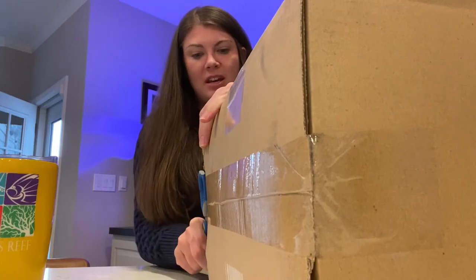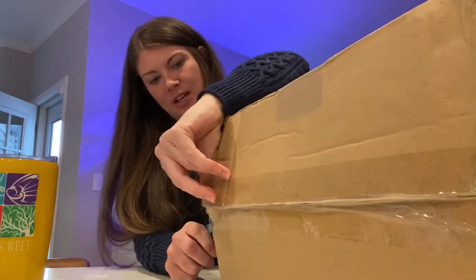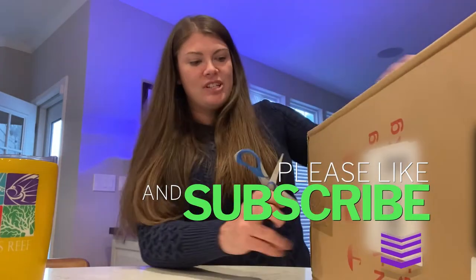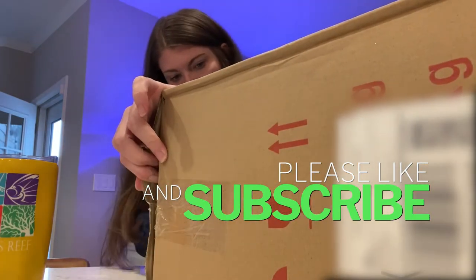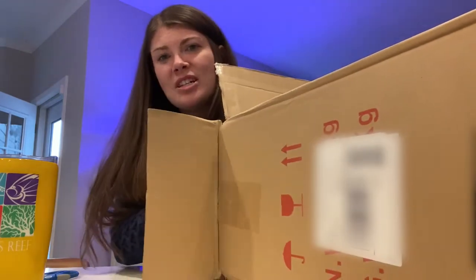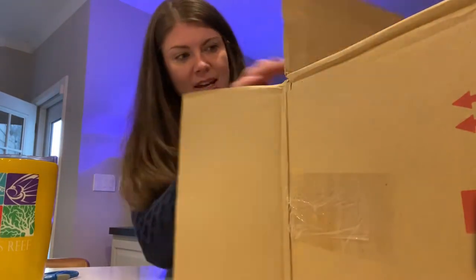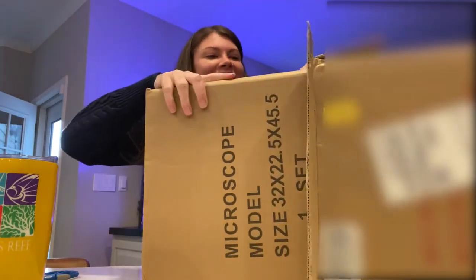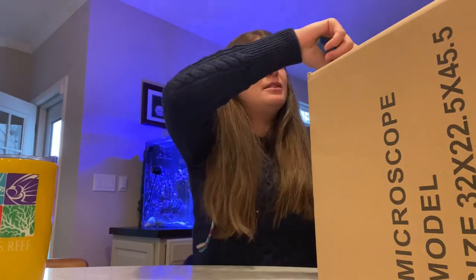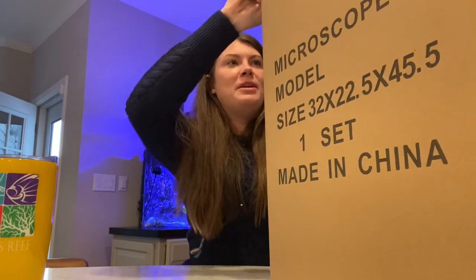I got a really nice microscope that I'm going to use to look at stuff in my tank. So hopefully it'll allow me to kind of start to identify some cyano, dinos, and different algaes, and if the fish are looking funky, being able to look and see what's going on their scales. And if I decide I want to put something that looks like hydroids, some hydroids under the microscope, I'll be able to check that out.